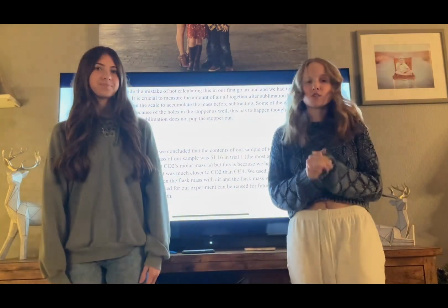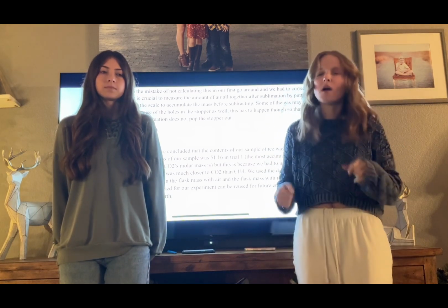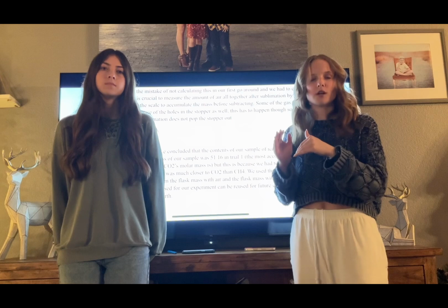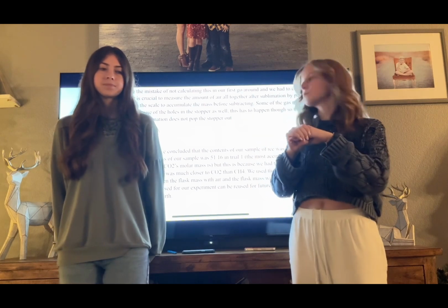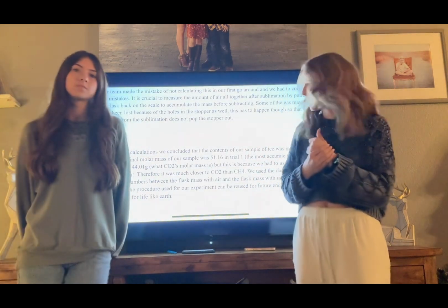And then onto why we chose our data. We did 2 trials, and the first trial is more usable data than trial 2, because in trial 2, the mass of the flask with air, and the mass of the flask with air and gas mixed together, were too similar, and it wouldn't be able to be used because you can't really discern between 2 similar values. And then furthermore, this could be used in the future when NASA is looking for new planets and in their future endeavors.